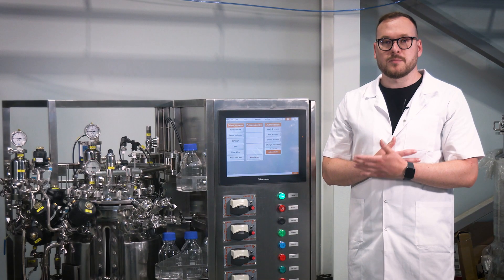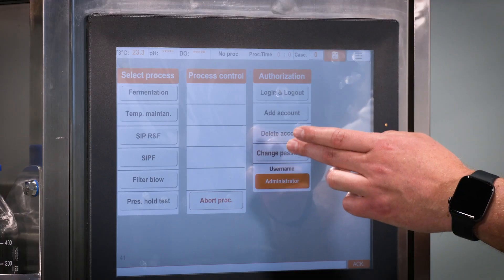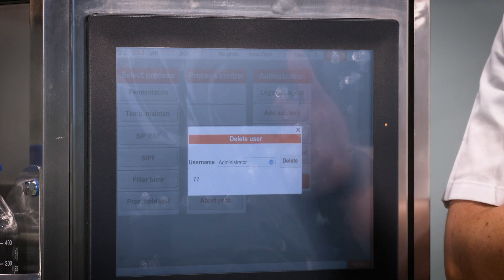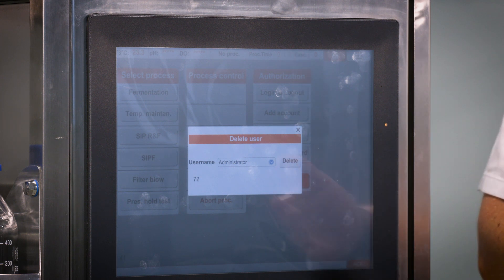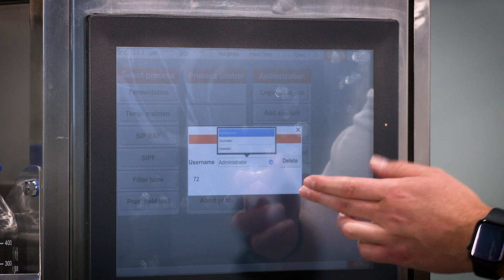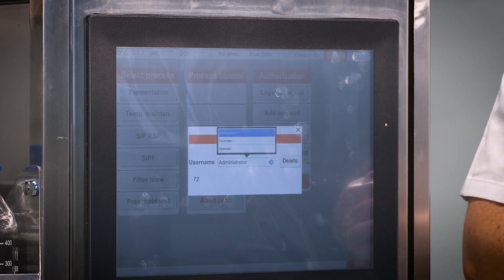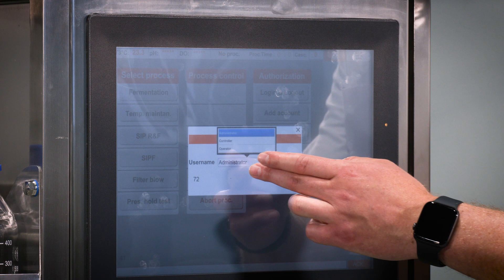The deletion of user accounts: Press the delete account button and a pop-up window will appear. Select the desired user name which should be deleted and then press the delete button to confirm your operation.